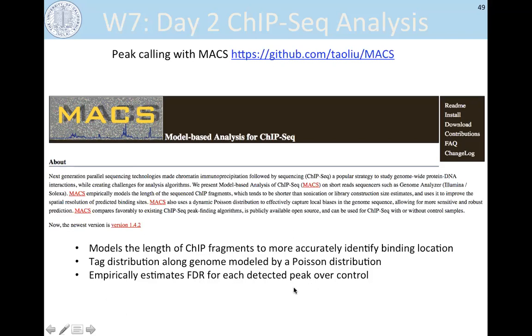For us, it's going to use our input file and use local windows of different sizes in the peak region it wants to determine significance for. It'll estimate the expected number of reads in that region by determining a lambda value, by counting in different window sizes and the peak range for the control.